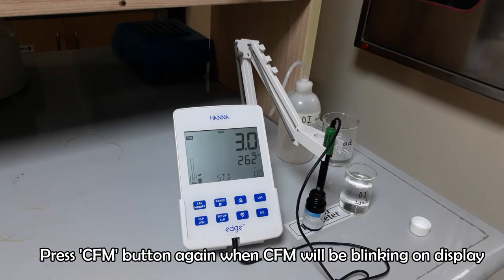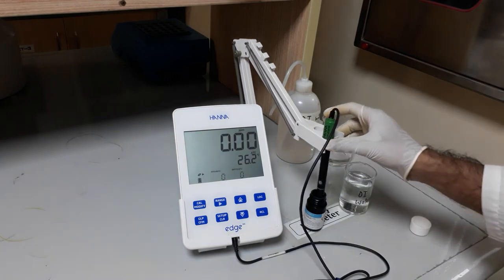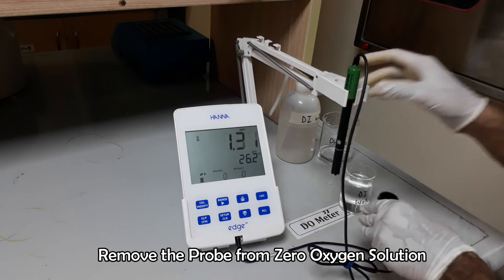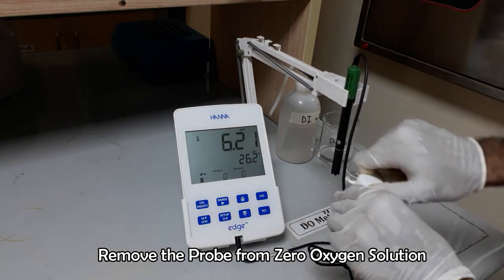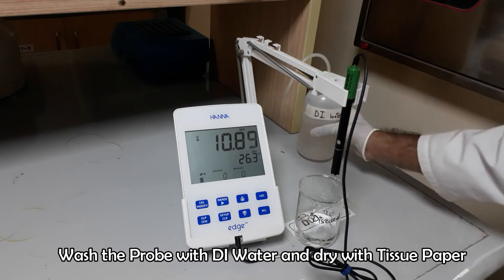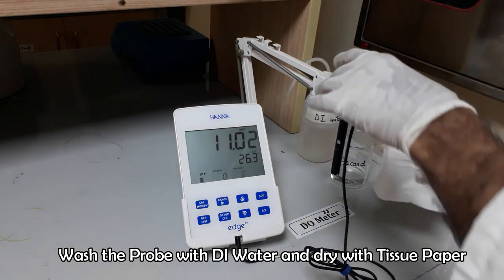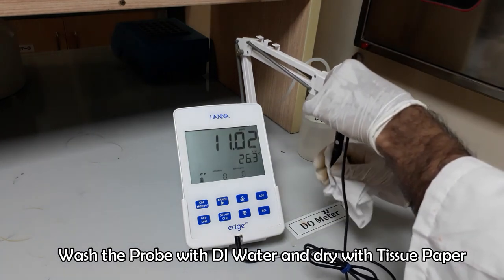Once it is shown, press the CFM button. Calibration is done. Now we are ready for checking DO of our sample.